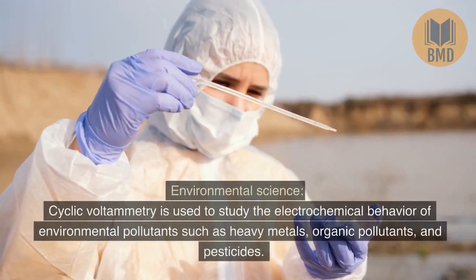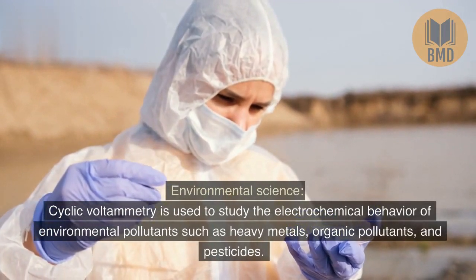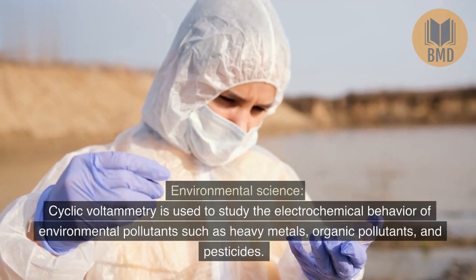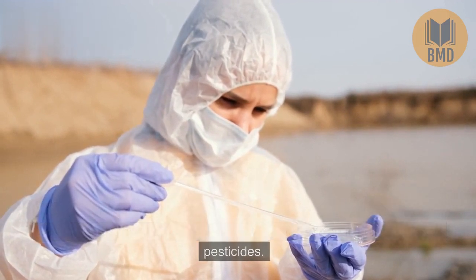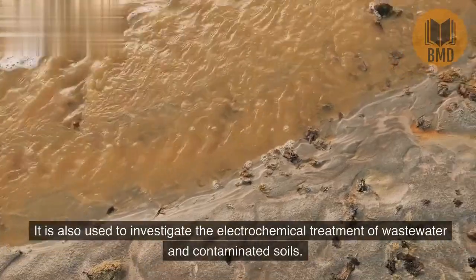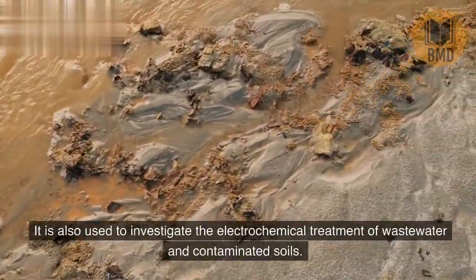Environmental science. Cyclic voltammetry is used to study the electrochemical behavior of environmental pollutants such as heavy metals, organic pollutants, and pesticides. It is also used to investigate the electrochemical treatment of wastewater and contaminated soils.